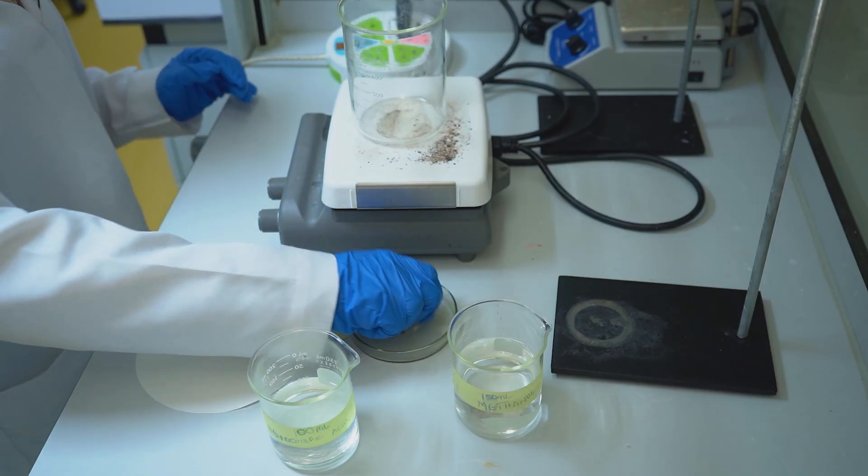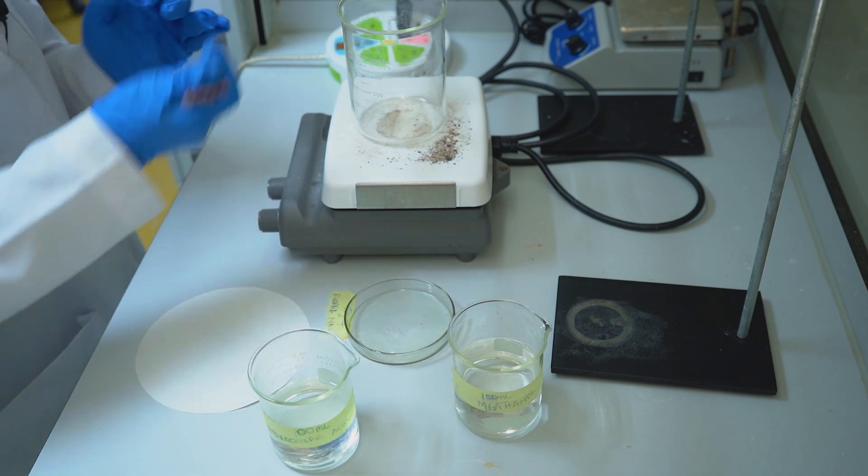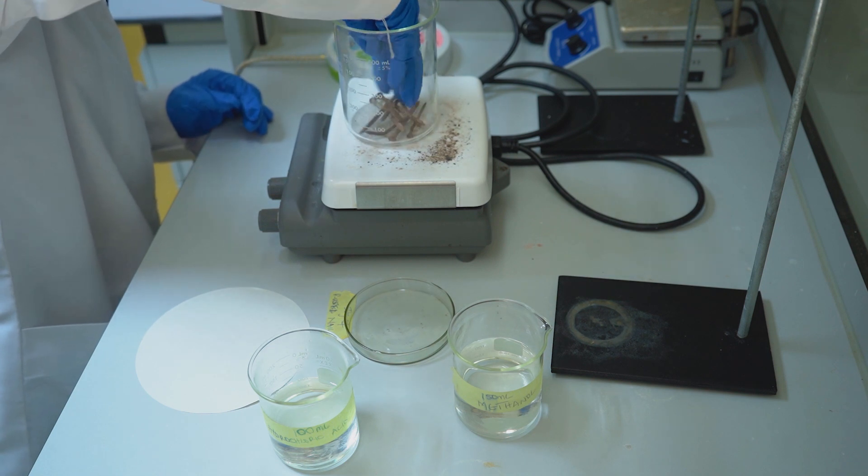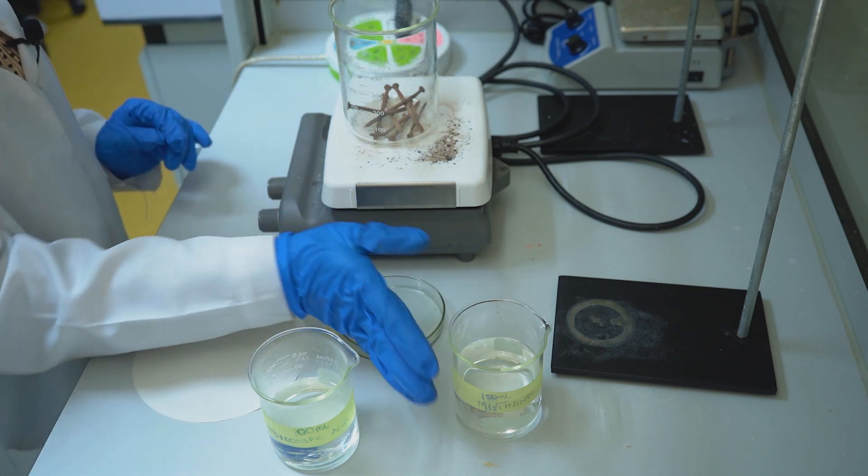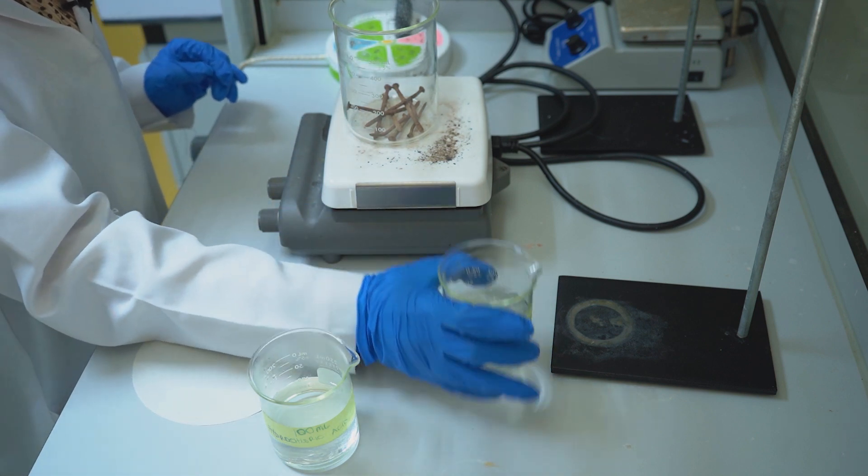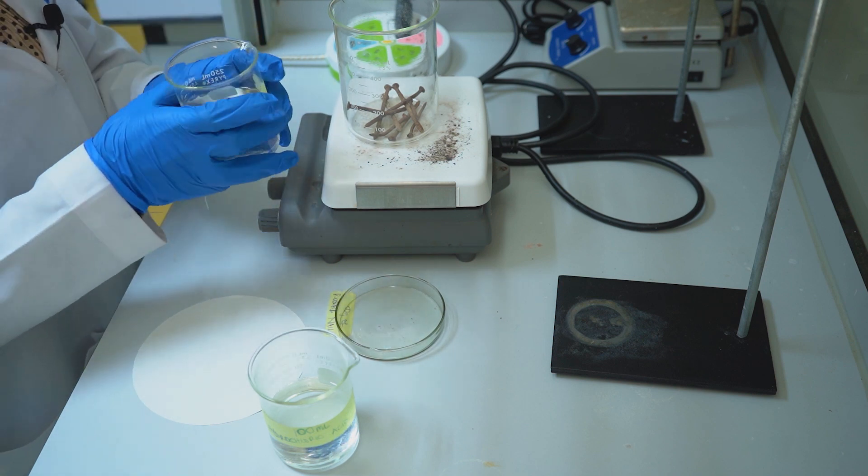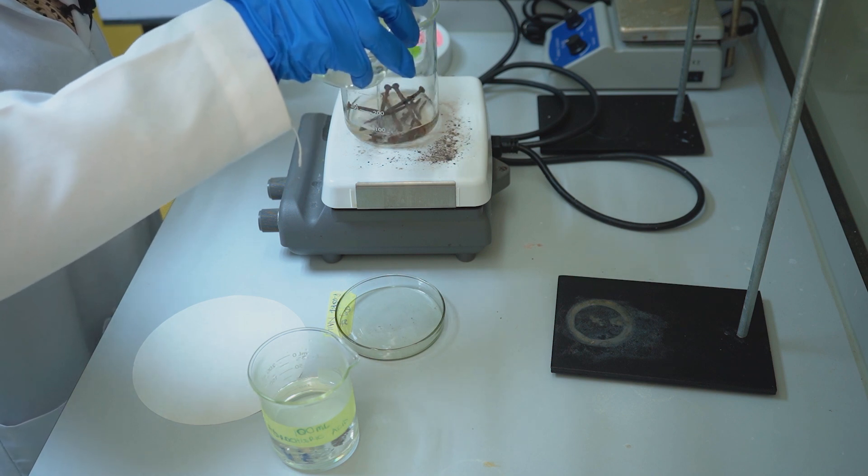Transfer the 50 grams of rusted nails into a clean 600 ml beaker. These are 150 ml methanol, carefully add it to the rusted nails.